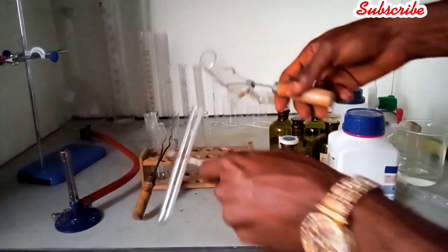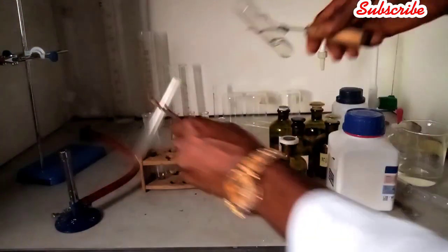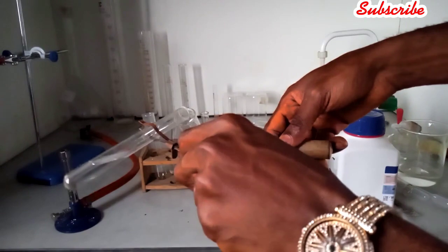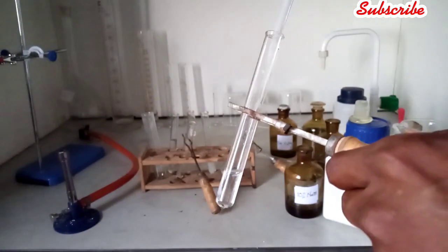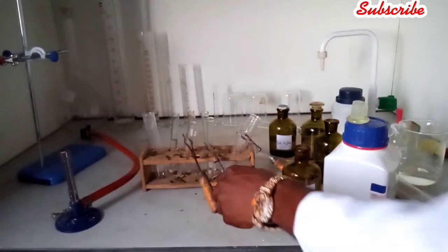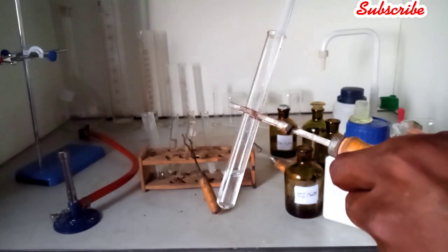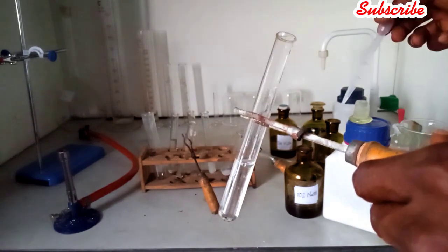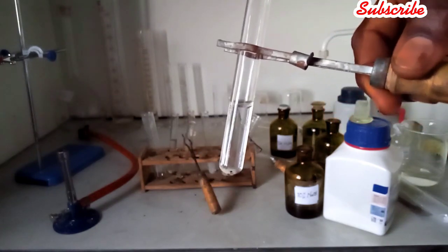And then you divide into 2 test tubes. To the first portion, add ammonia in drops. You have a white precipitate that dissolves in excess. So to the other portion, add caustic soda in drops and then in excess. In drops, also a white precipitate, and in excess, you see the precipitate dissolve. This confirms the presence of zinc.